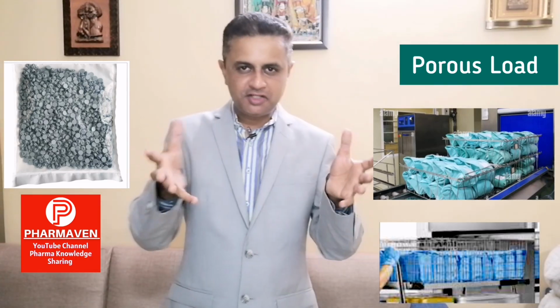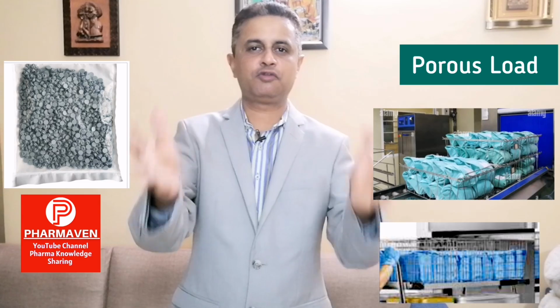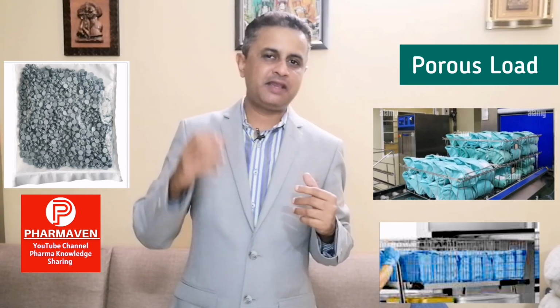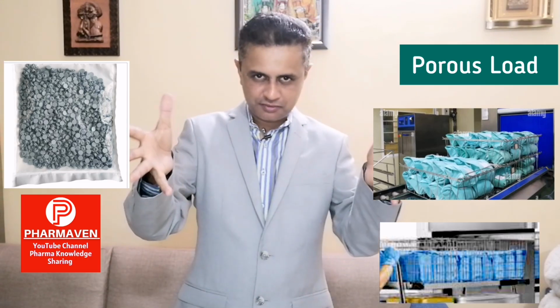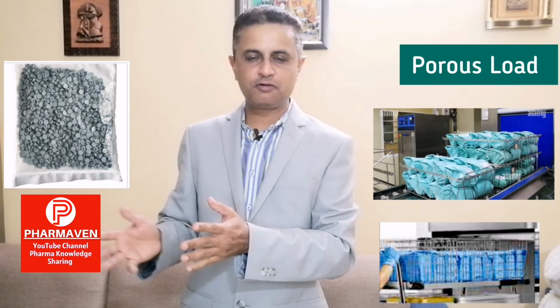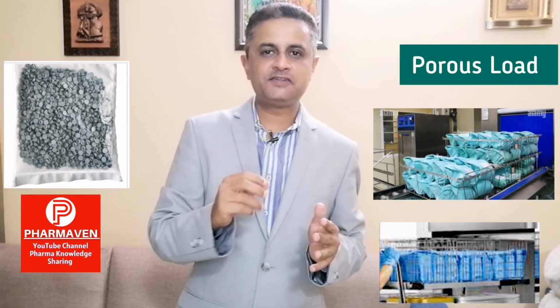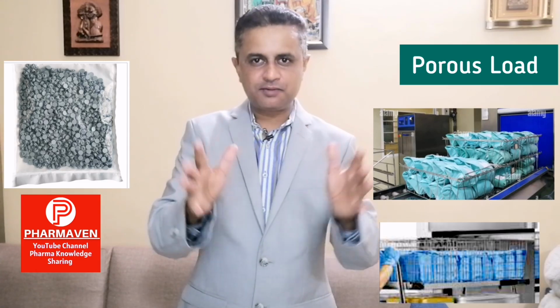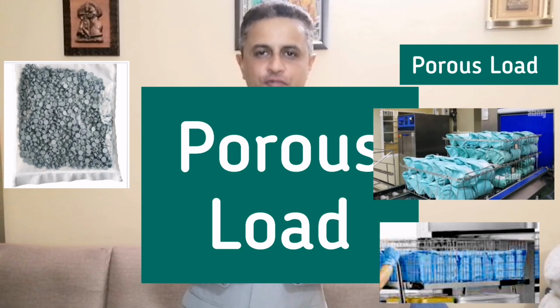If this much quantity is in a single bag and we are putting 20-30 such bags inside the autoclave, then in terms of vacuum pulse, in terms of air removal, to cause effective sterilization within these big bags, it will be difficult compared to loads which are very solid. Hence we need a clear-cut differentiation of what is a porous load. As I explained, such items will fall under the category of porous load.